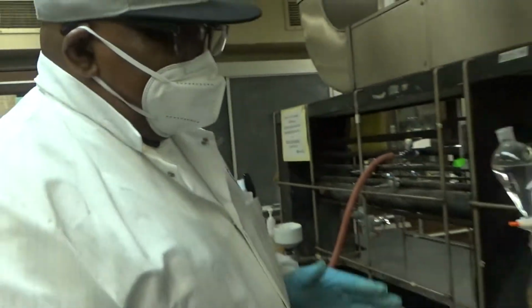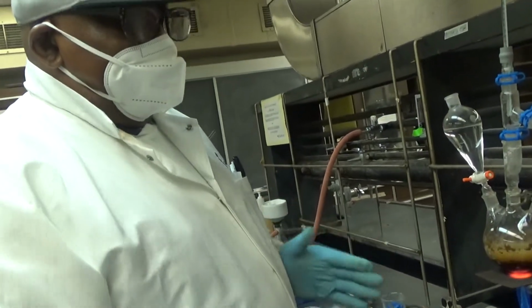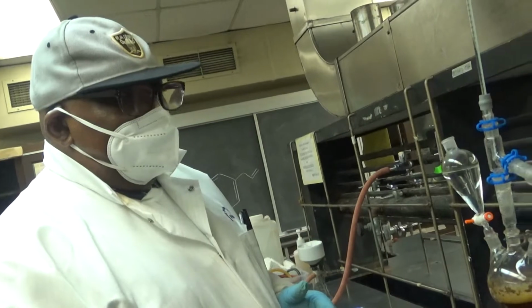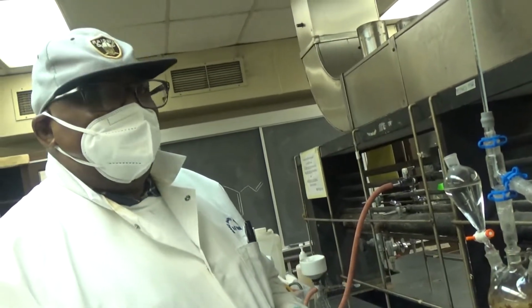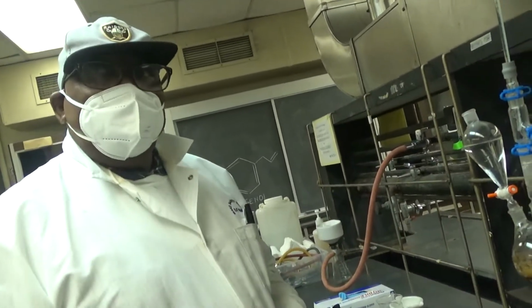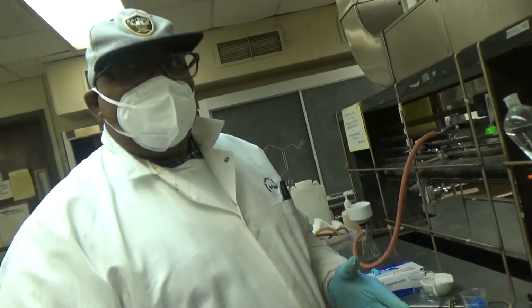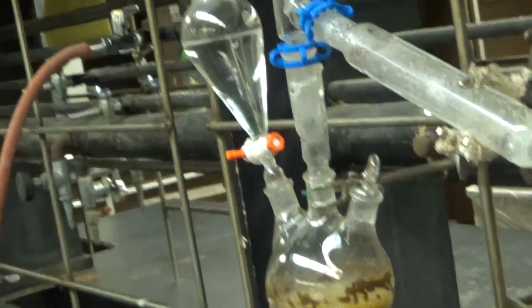Okay, so I need to speak about boiling points here. Eugenol has a boiling point of 250 degrees Celsius, very high. Water has a boiling point of 100 degrees Celsius. When you do a steam distillation, you collect your co-distillate at a temperature lower than 100 degrees Celsius. In our case, you are collecting it at about 95 degrees Celsius. So something really high boiling comes off at a lower temperature, and you do that to avoid decomposition of eugenol, because at its boiling point it might decompose.